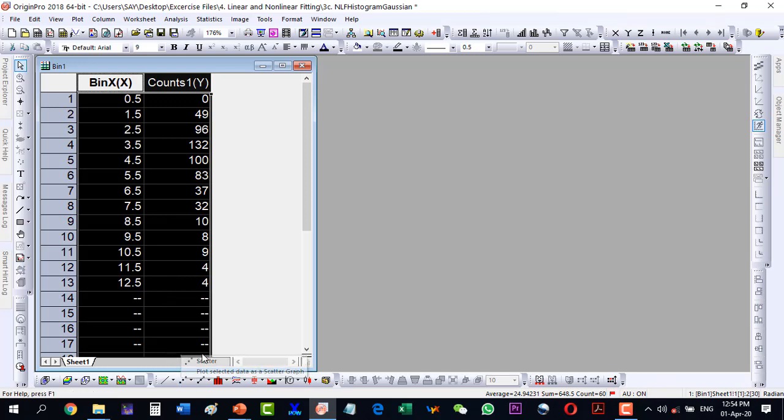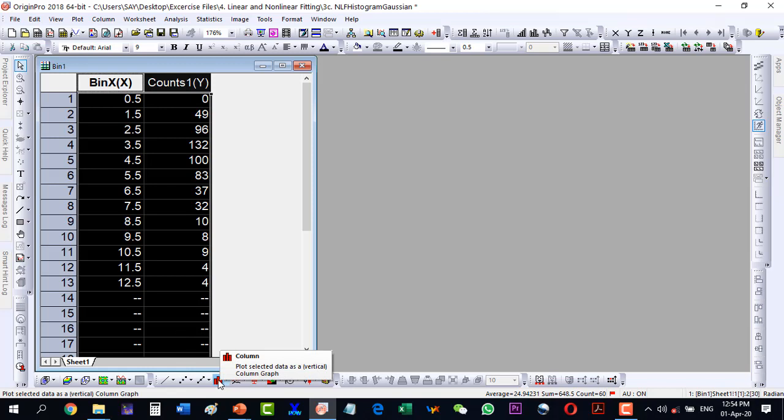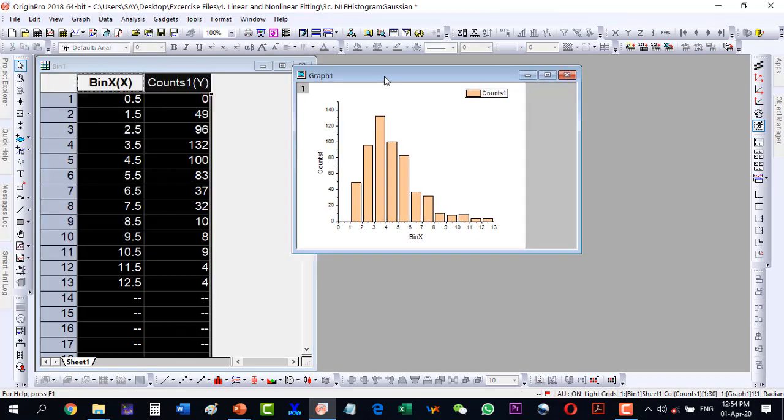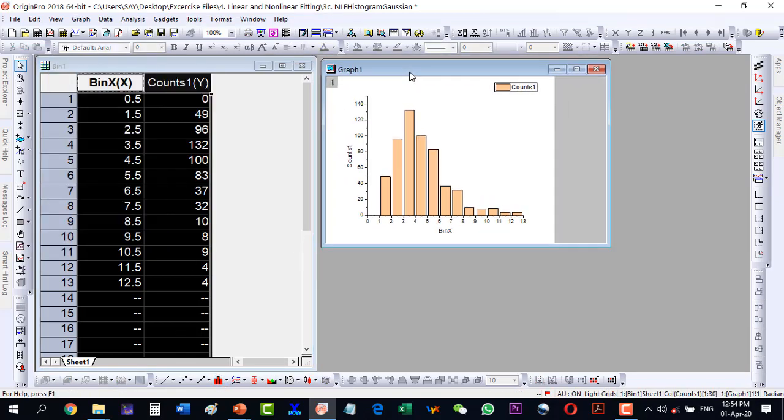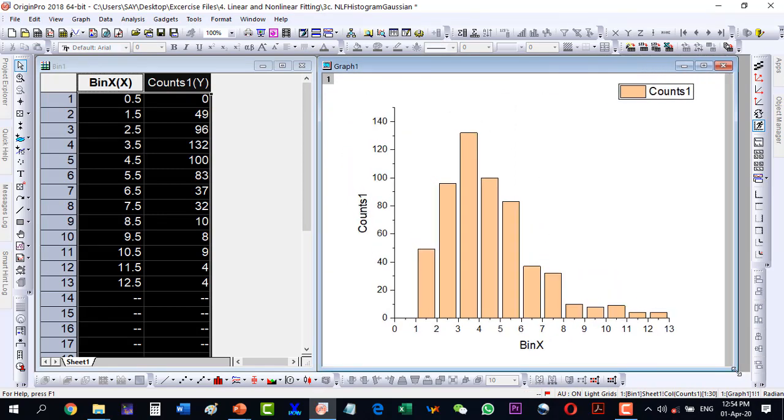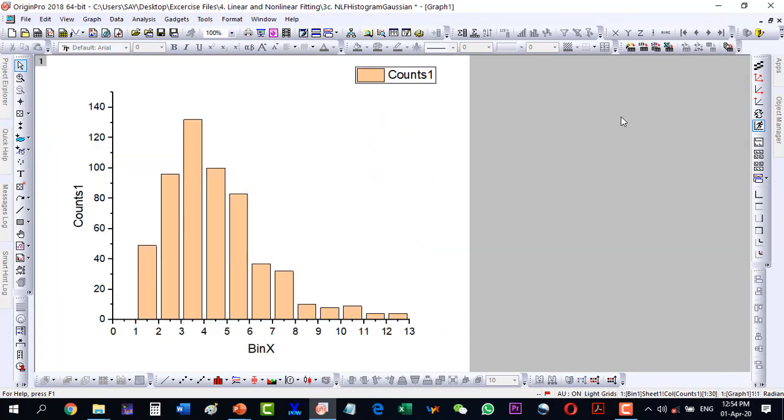So start, select the data and go to a column plot. By clicking the column plot I have plotted the data. Now let me maximize this one as we need it to be more visible.